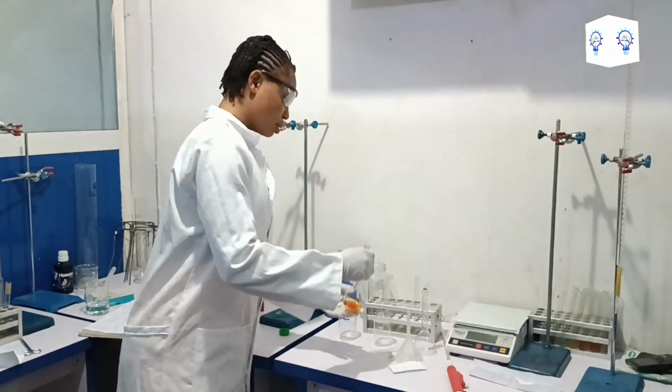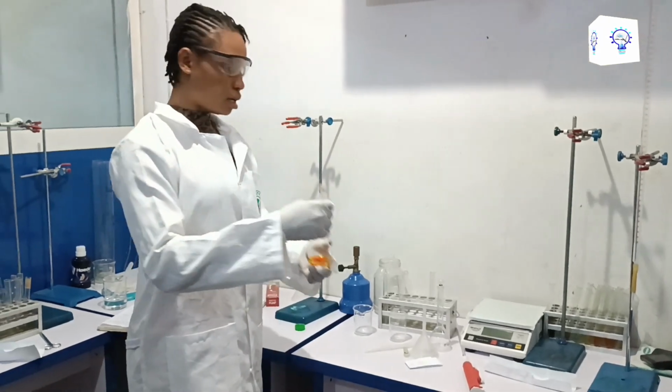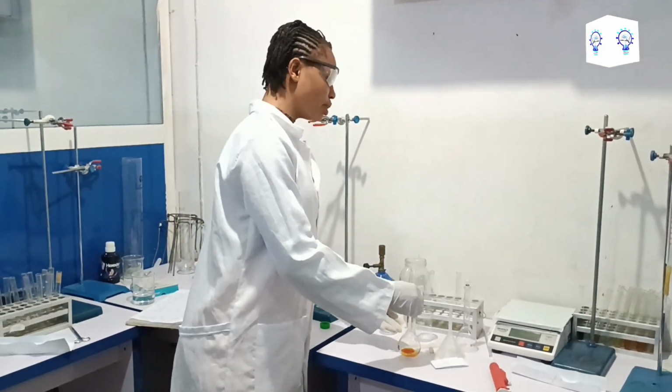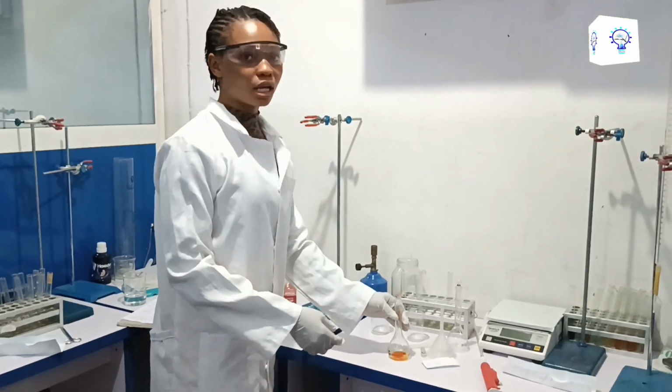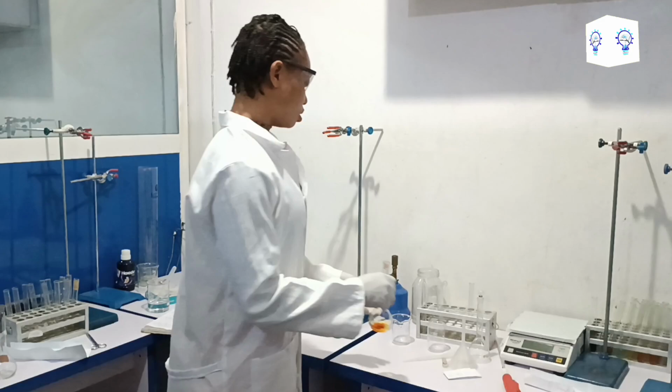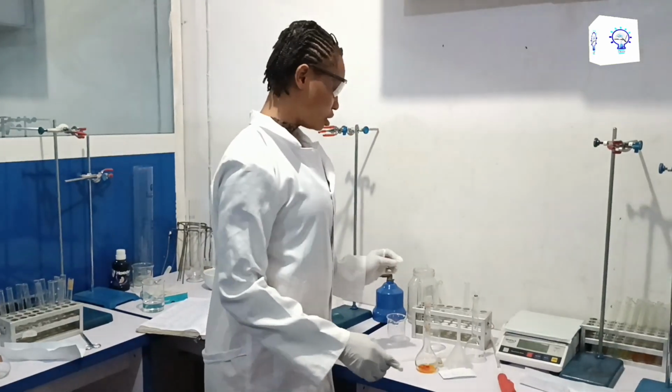This experiment is to prepare a reagent. A reagent is a combination of chemicals, and the purpose of preparing the reagent is to detect whether there is a presence of ketone or aldehyde. So watch me as I do it.